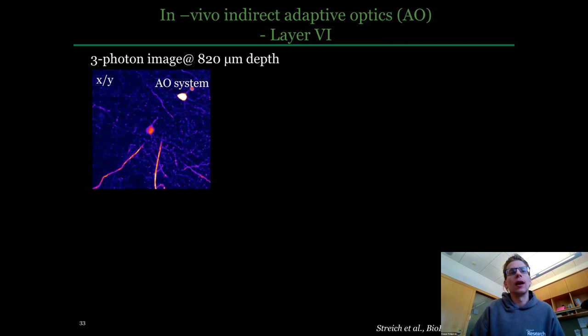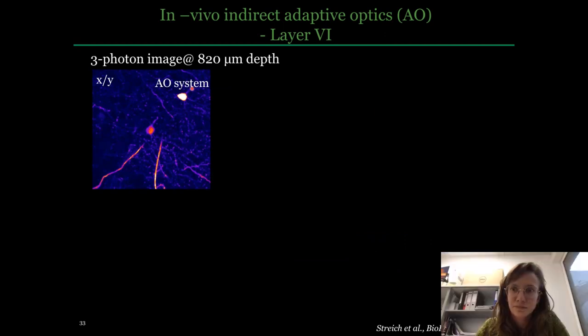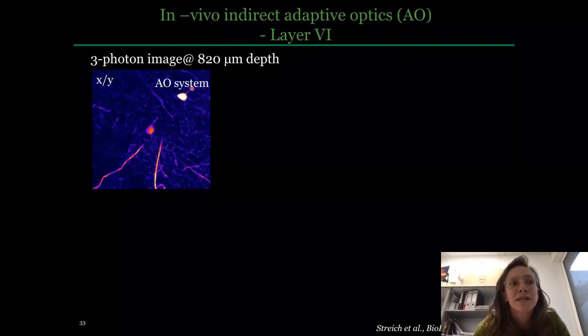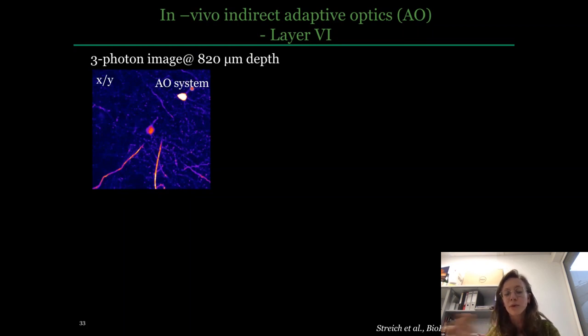It sounds like you had frame rate on the previous slide, but I guess that's just the frame rate drawing to the DM, and you're doing point corrections here rather than collecting a little volume. Is that right? No, actually, we are scanning. So normally with the 64 × 64 resolution, and then scanning over the entire somata, which mainly also in three-photon, even though we significantly reduce the excitation power, scanning still distributes the power, so that we are not really focusing onto one spot.